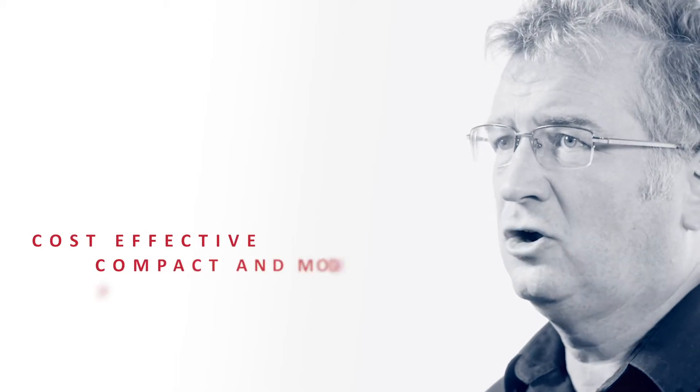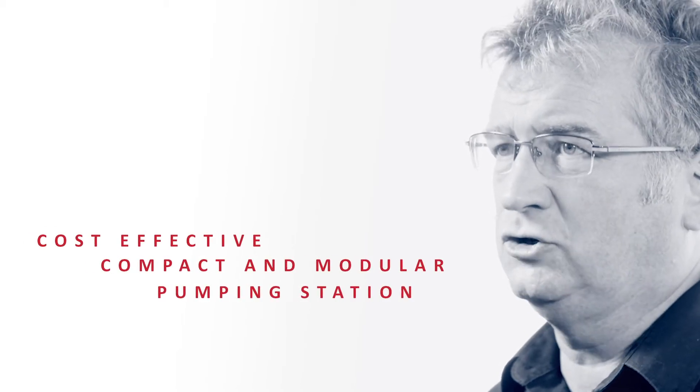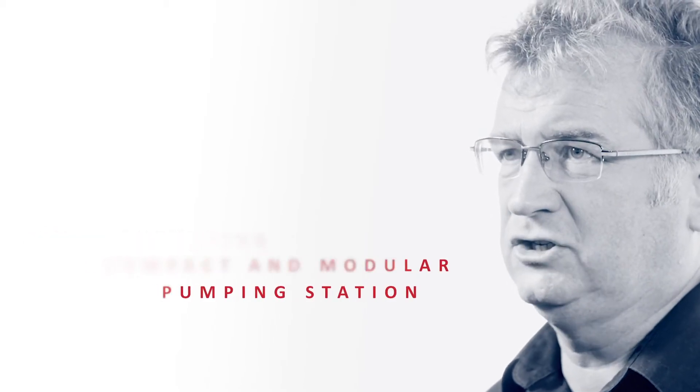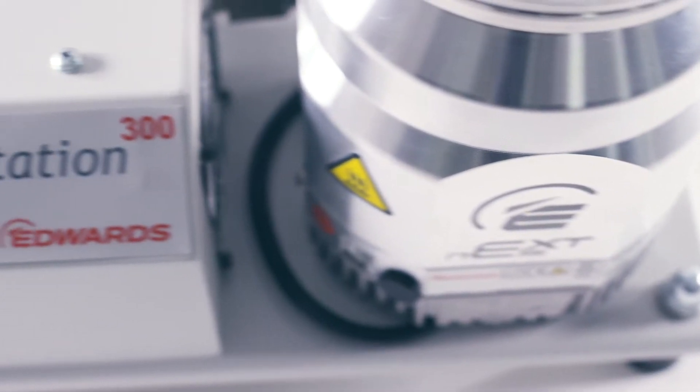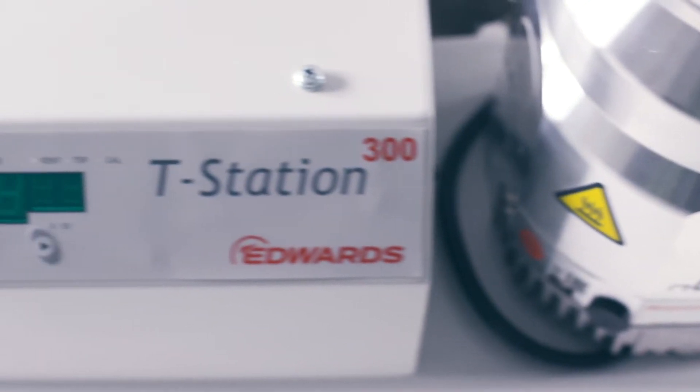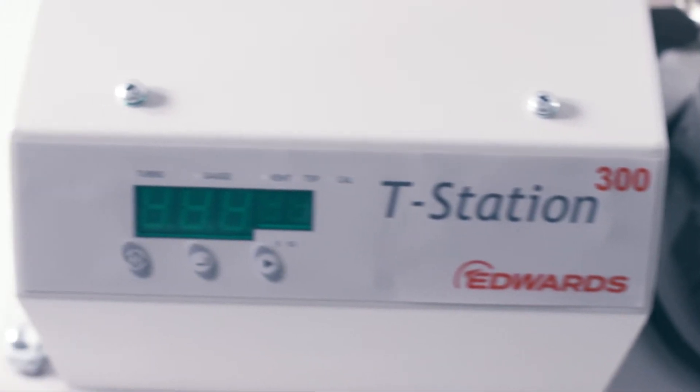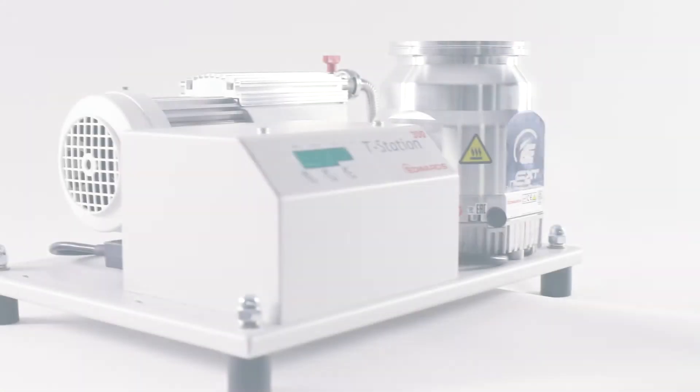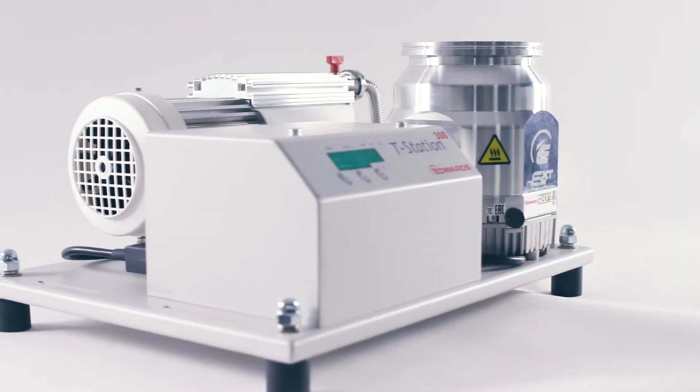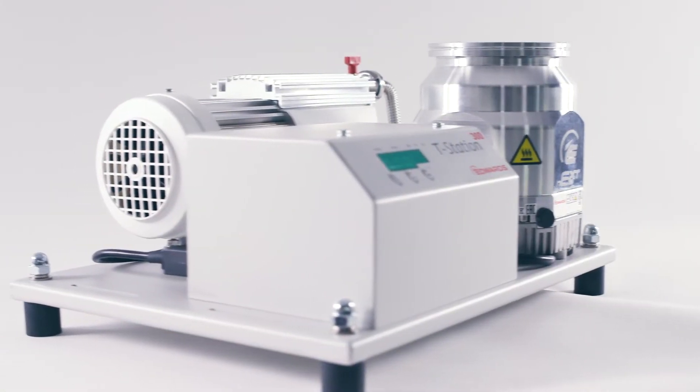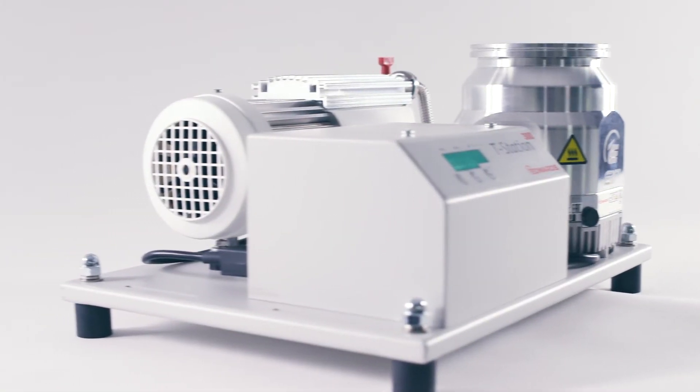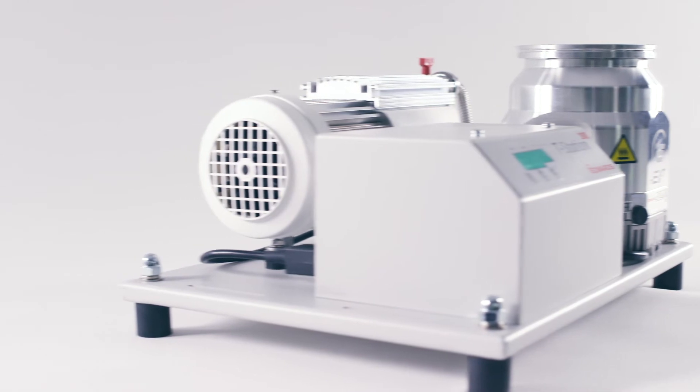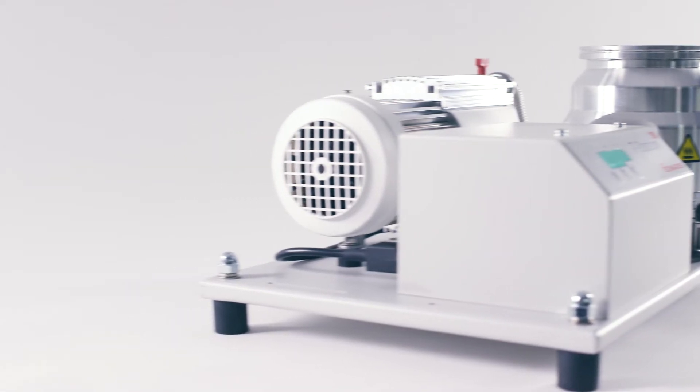T-Station 300, like all our T-Stations, is a cost-effective, compact and modular pumping station that combines the NEXT turbo molecular pump and an Edwards TAG controller with either the E2M 1.5 oil-sealed rotary vane pump or the dry XDD1 diaphragm pump.